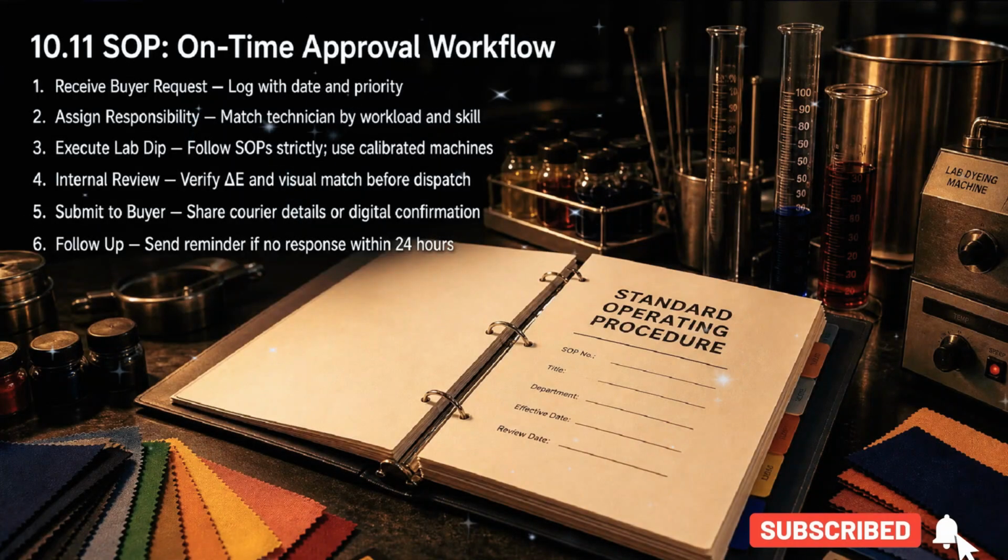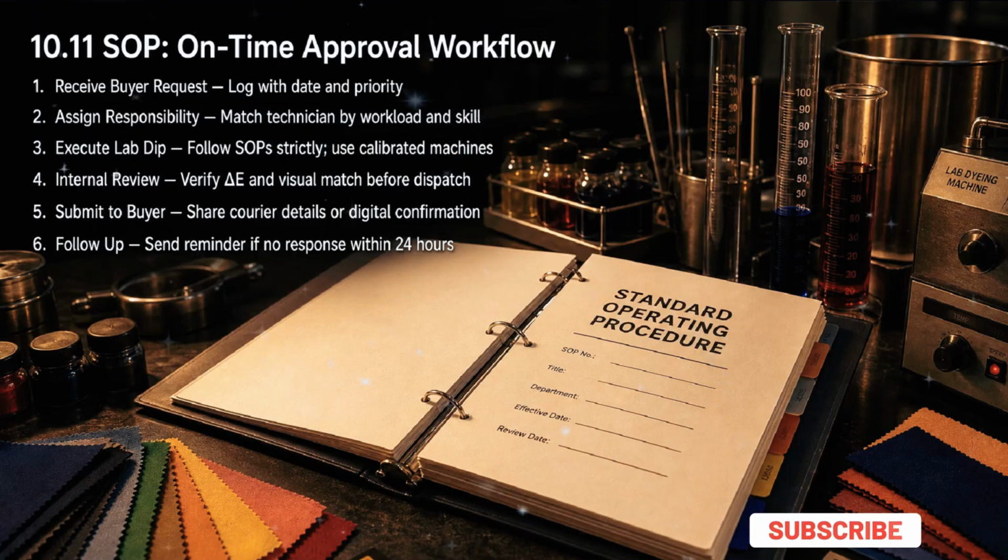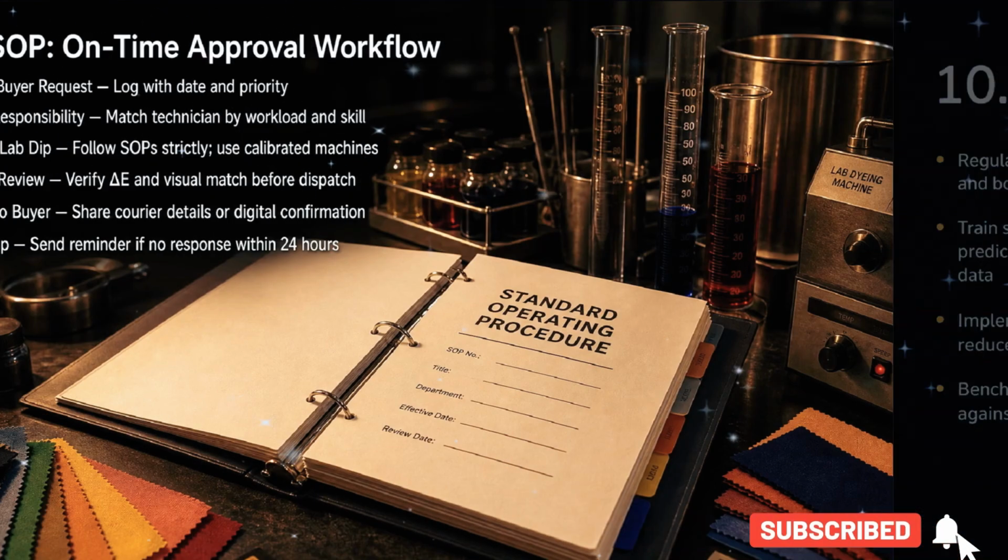Standardize your operations. A clear SOP for the approval workflow, from initial logging and task assignment to internal review and buyer follow-up, is essential for consistent results.